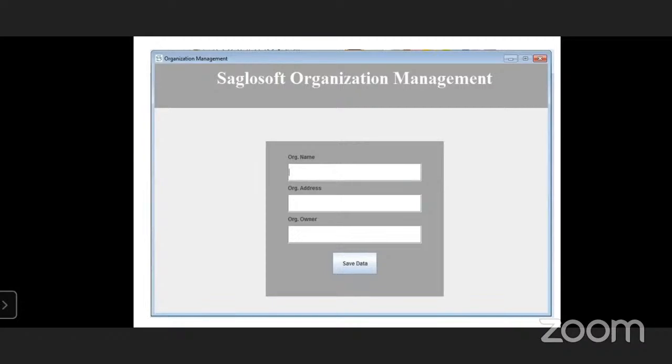So that's why we added this organization management. याच्यामध्ये जेव्हा कस्टमरला सॉफ्टवेअर दिलं जातं त्यावेळेस कस्टमरचा ऑर्गनायझेशन, त्याचा ऍड्रेस आणि त्याचा ओनर नेम, हे सगळे डाटा आम्ही एंट्री करतो. आणि एंट्री केल्यानंतर whatever the report generated from the software, that report is generated on the basis of the data entered into the organization management. So it is a validated software sold to that particular institute or R&D department. Okay, so that's why we developed this particular organization management.